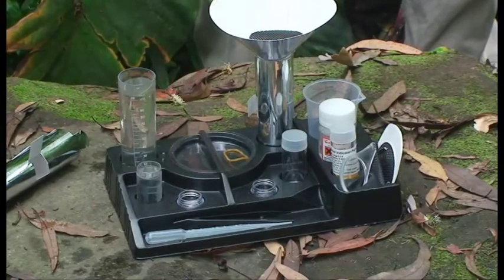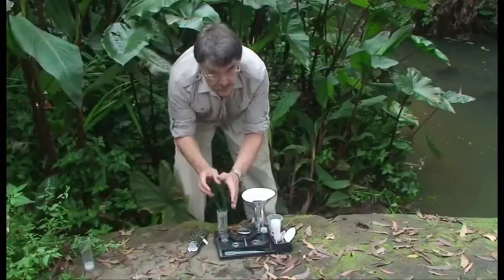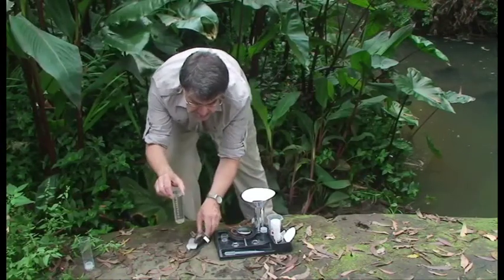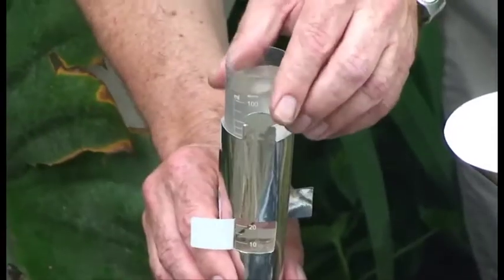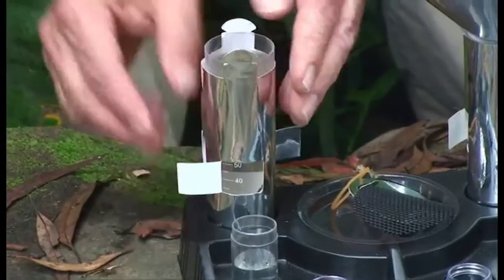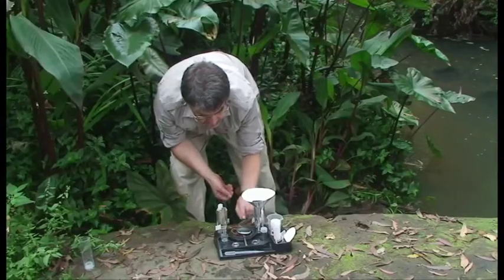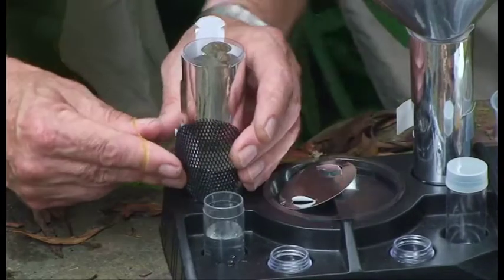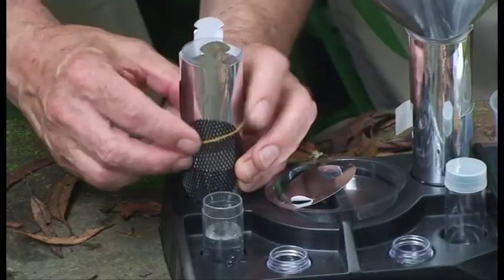To see how the testing happens you're going to have to come in and look closely. Now we're going to take a close look at some of the animals in this measuring cylinder. The way I do that is to put the measuring cylinder inside a light-proof tube like so. The tube has windows in it like this. I'm going to put a 3mm grid over the top of those windows and hold it in place with a rubber band.